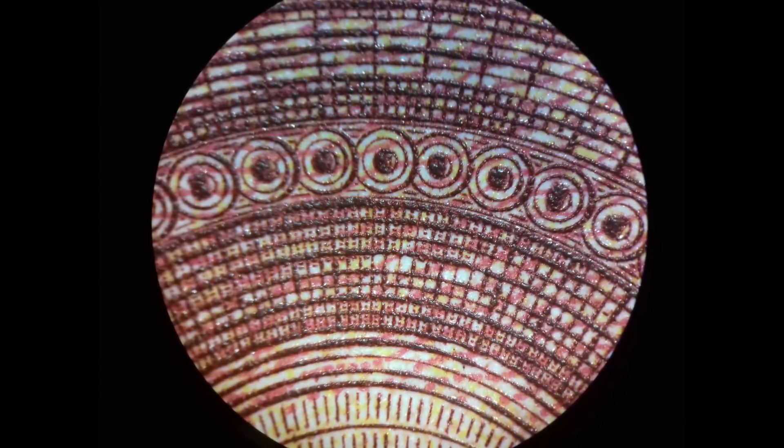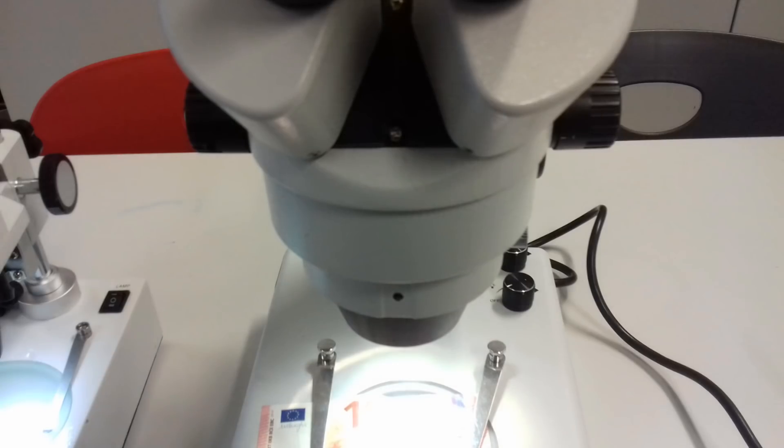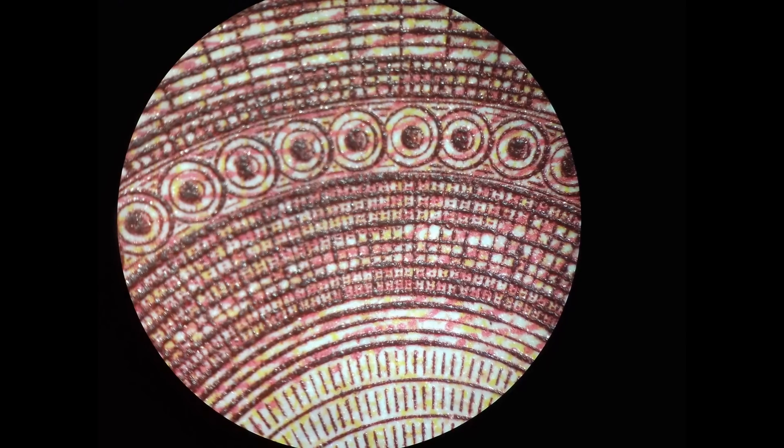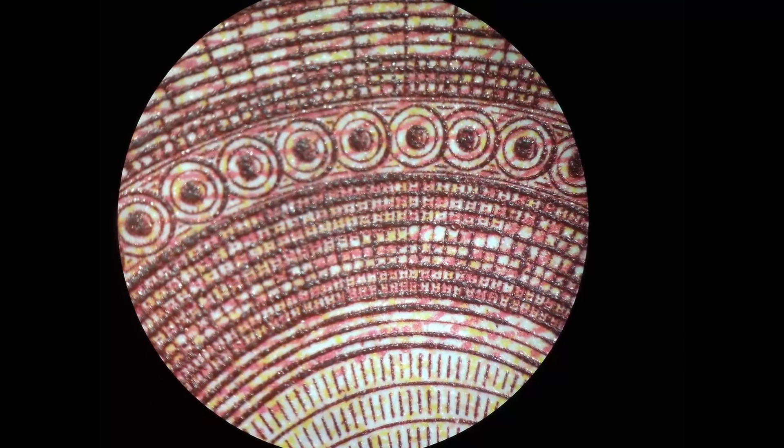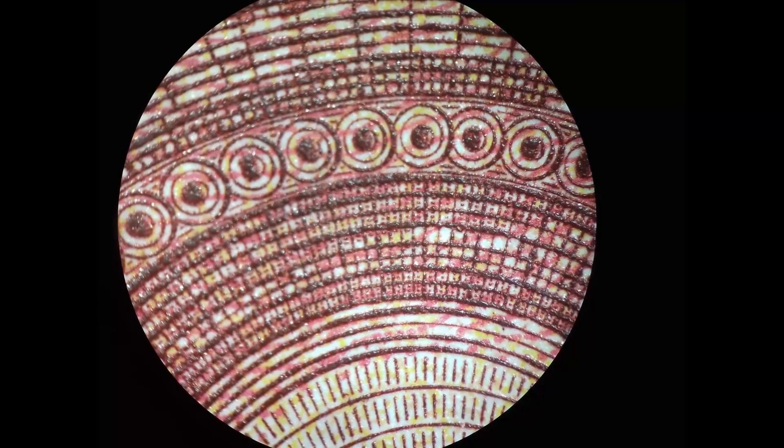I put a bill, a money bill, under the low cost and the high cost microscope. That's what you see here. I'm using the same magnification, I used 20x in both cases. Now that's the 10 euro bill under the more expensive one, and actually you can see that it looks pretty much the same. So concerning optical quality there's not much difference, but you can see that the diameter of the eyepiece is different.